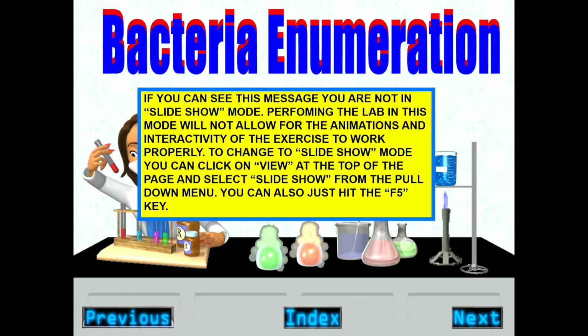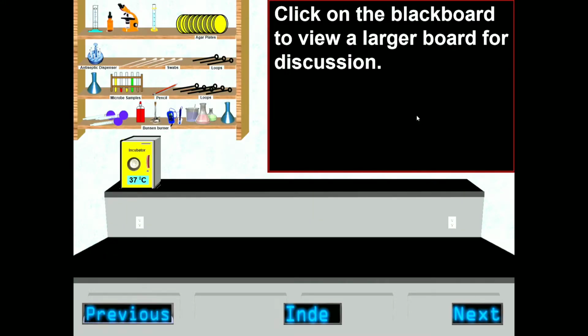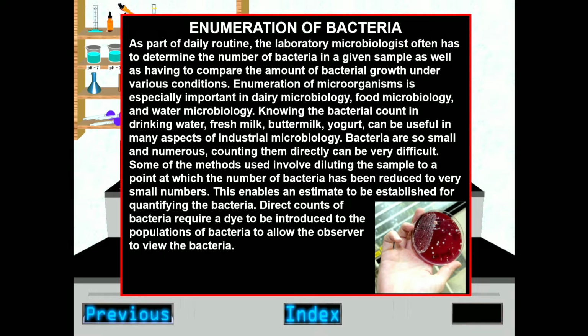Hi, it's Hosen here. Today I will show you how to enumerate bacteria by using this virtual lab. Before that, allow me to explain a little bit about bacterial enumeration.